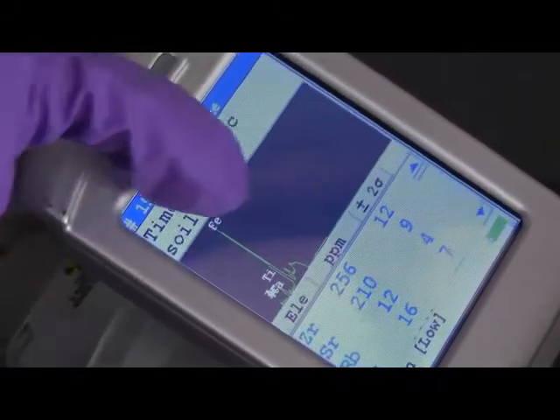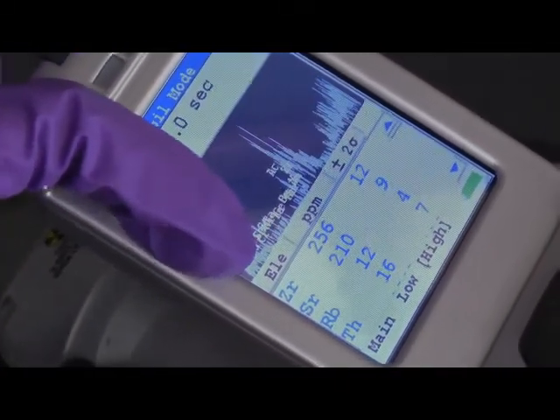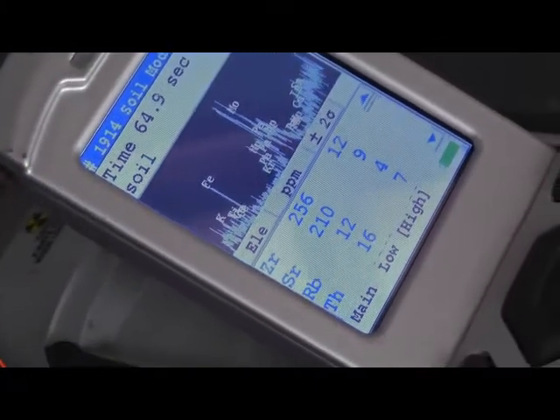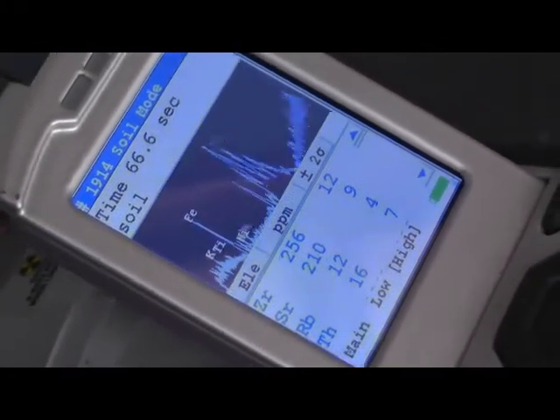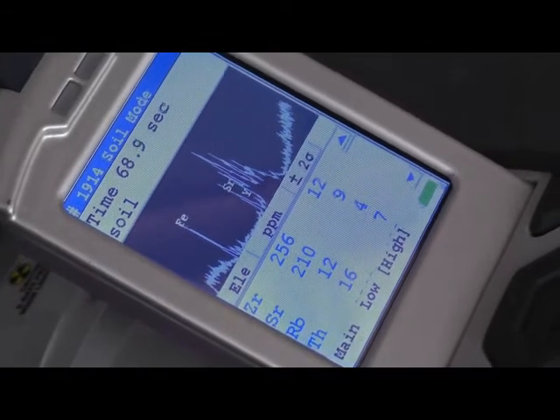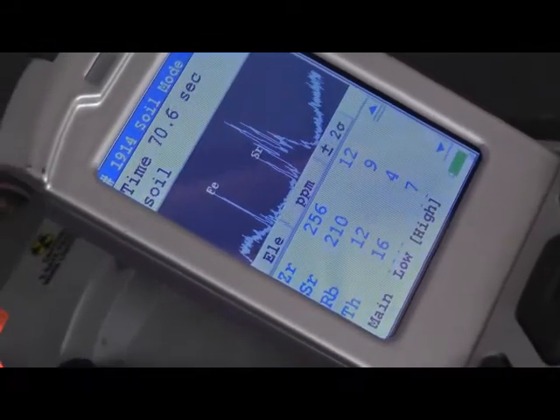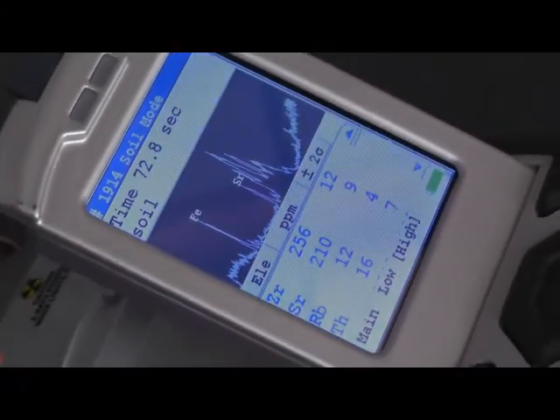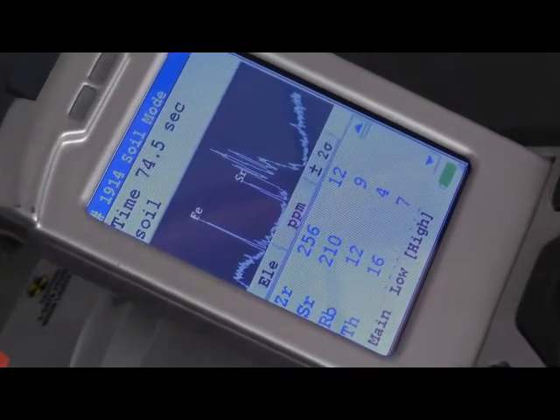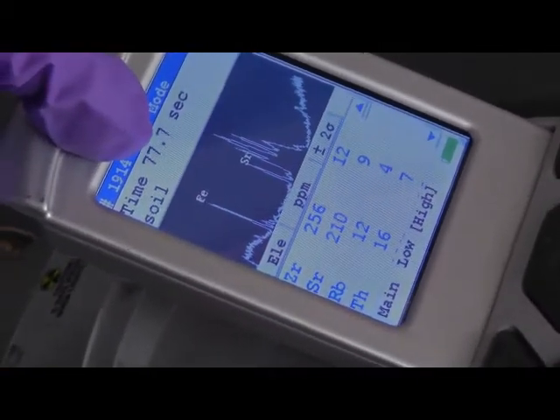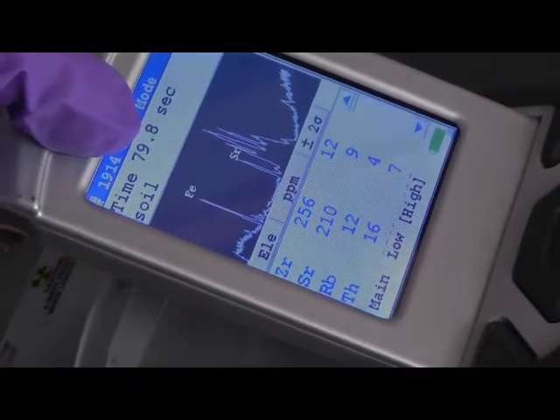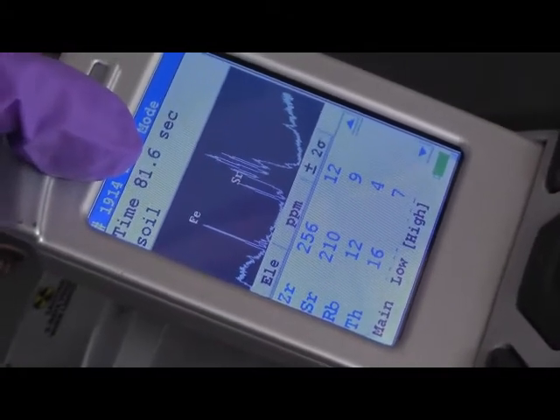So the first column, elements. And the second column, the concentration of each element is the most important information that we will be able to obtain from XRF measurement. And the time measurement is here. So we are shooting for 90 seconds. And it's almost there.